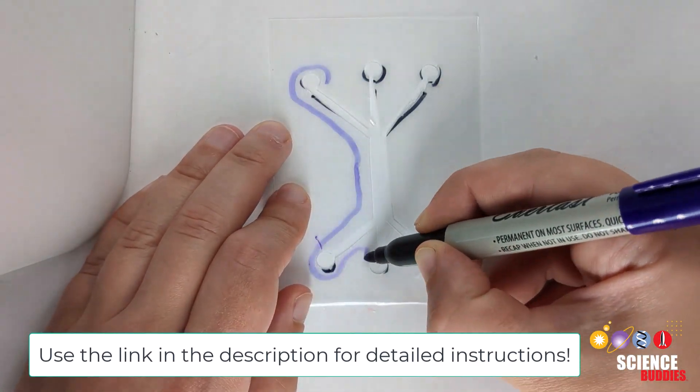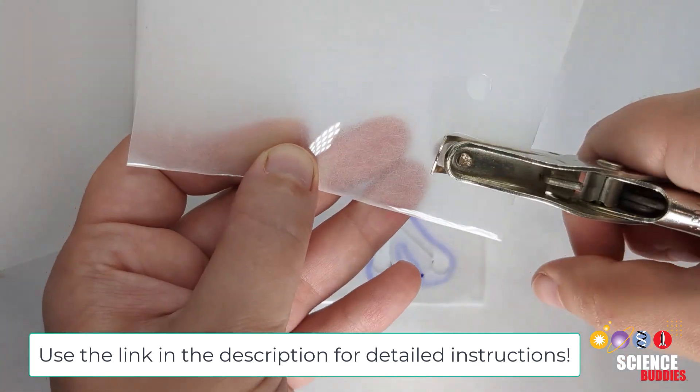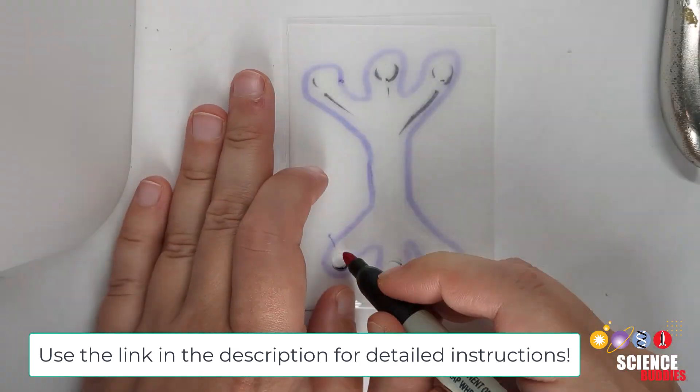Next, trace around your design to more easily align each sheet when they are layered. Then, place the top or bottom sheet onto the middle sheet to trace and punch out each input or output hole.